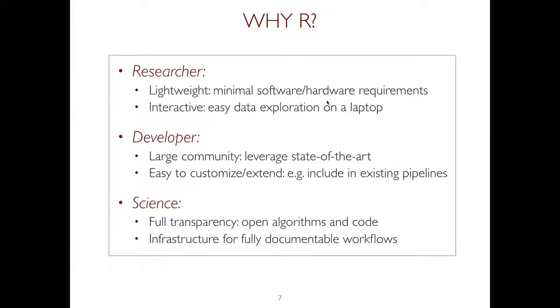And I think most importantly, we like to work with scripting tools and with R, because we think that it contributes to good science. As I was mentioning earlier, your script is your best documentation, because it requires you to say exactly what you did everywhere, and we find that this is the best way to document the workflow. And of course, things being open source, it means that you can open them up, you can look at what we do, you can modify them, you can criticize them, you can say you don't agree with us, and that's how things are, right? So we think this is a good way to go. So that's really the introduction to what we do with R.